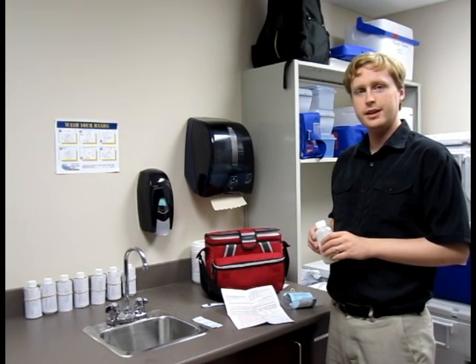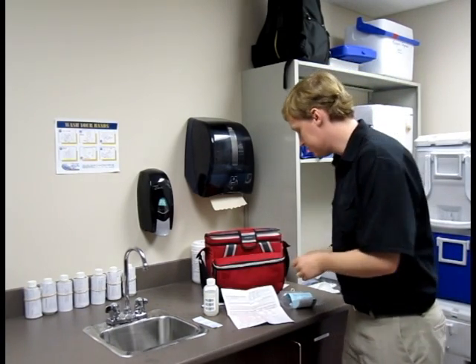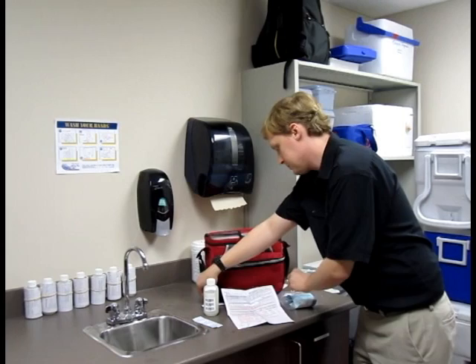How to take a water sample properly. First, fill out the required paperwork completely to ensure the lab will test the sample and the results will make it back to you.